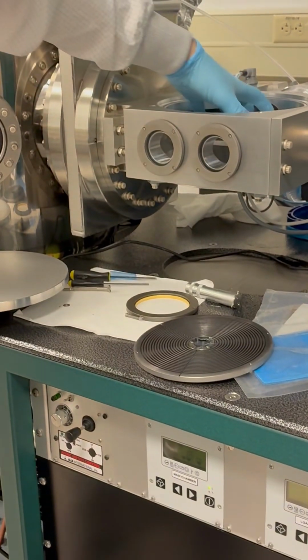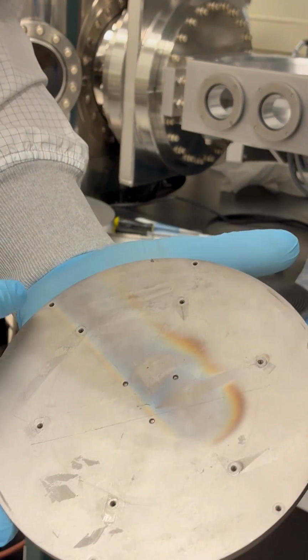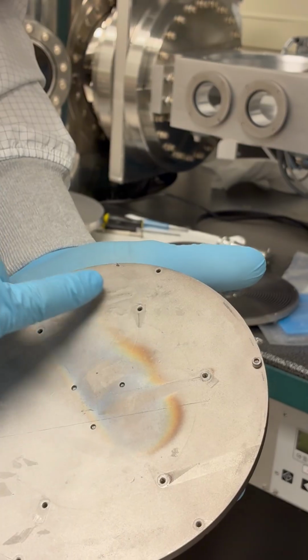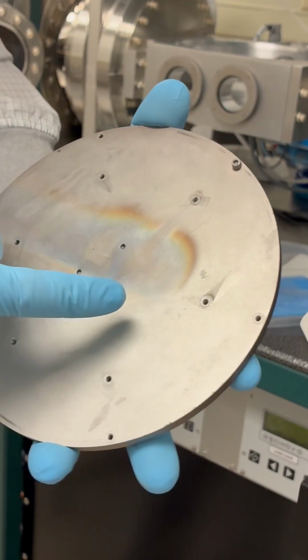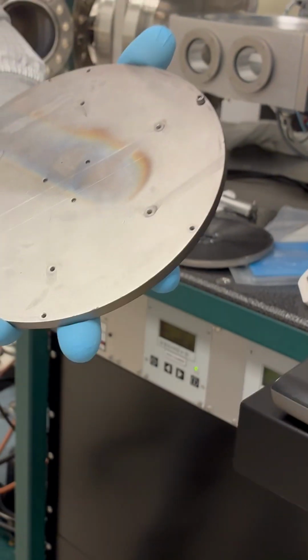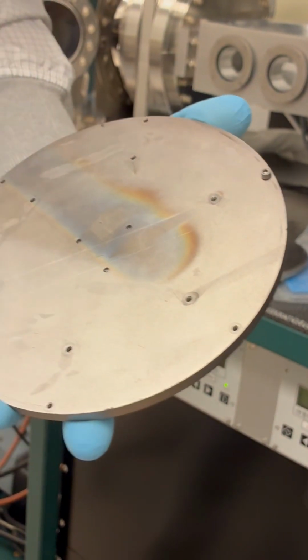Okay. We've come up to atmosphere. Now, during the platinum growth, I left the rotation off. And so you can see this is where the QCM was. It was blocking the sample from getting platinum grown on it, and you can see where that blockage happened. Okay? When you do a normal growth, you want to have rotation.